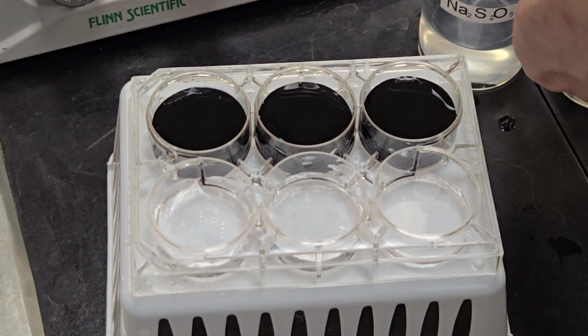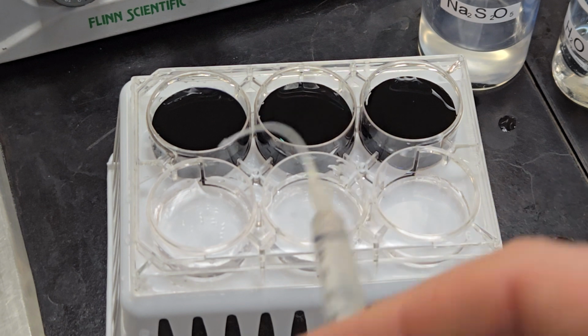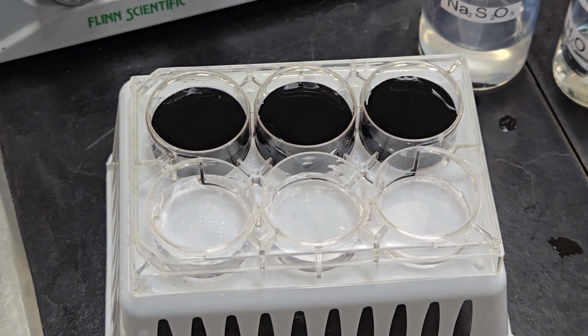All right, getting my 2 milliliters for reaction in plate number 4. Here we go. Adding to plate number 4 now. Watching the time at the bottom. Certainly you've already noticed that the time increases. The reaction rate slows down, and the time that it takes for the reaction to happen increases as our concentration decreases. That should give you a hint as to what kind of pattern you're going to see on your graph.